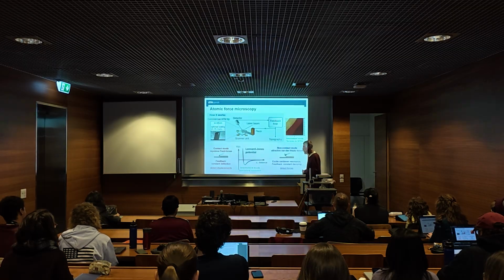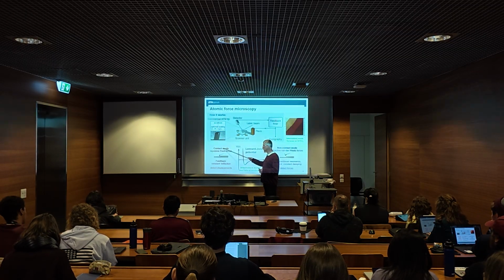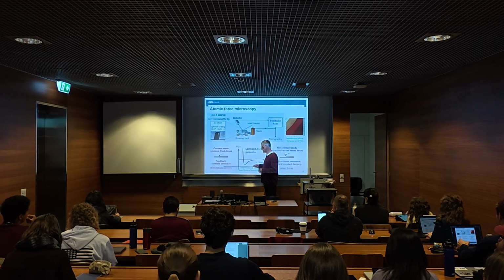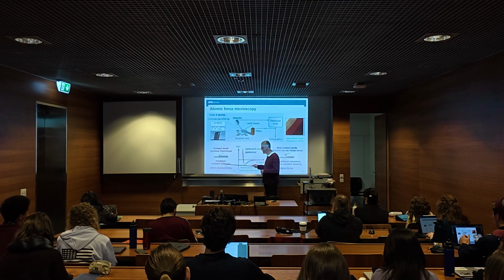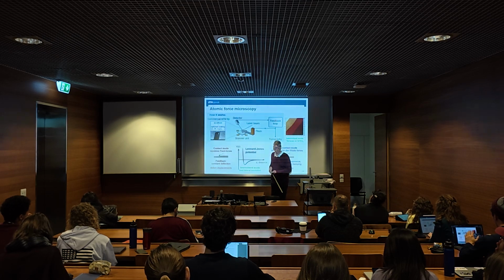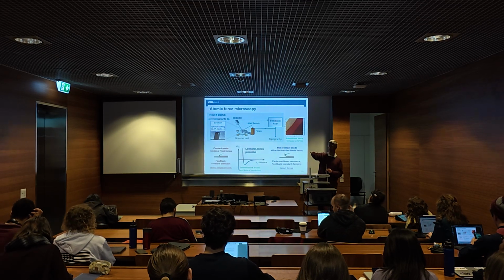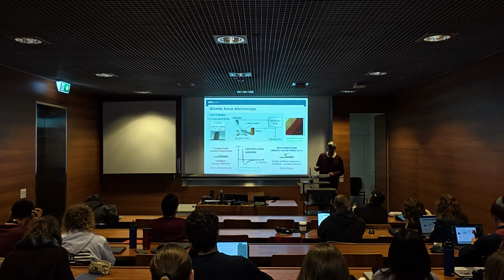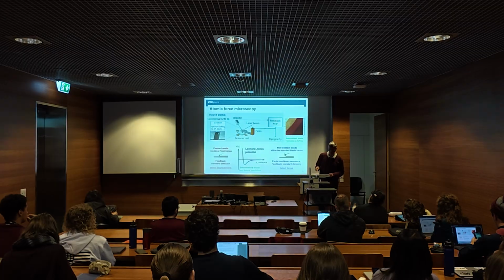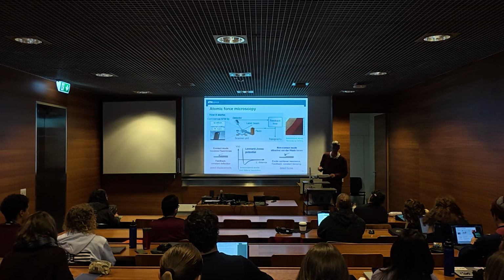So then you can have two modes. Either you are always in contact, so then you would move your tip across the surface and try to always keep the same deflection of your lever. So if you always keep the same deflection, say here's my tip, now it's attracted, then you move, then at this point it would go up, because this terrace ends.